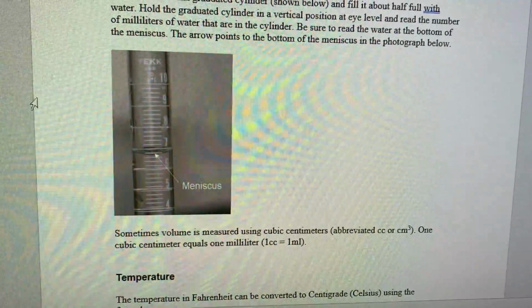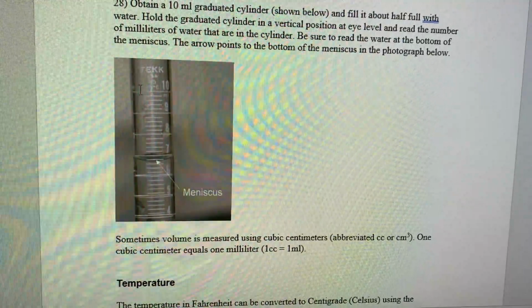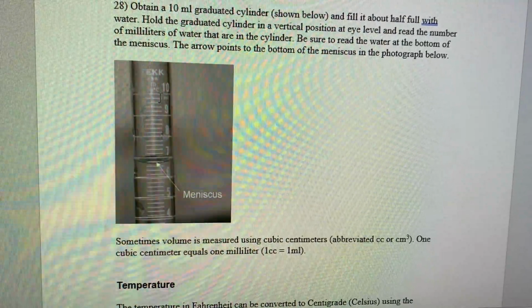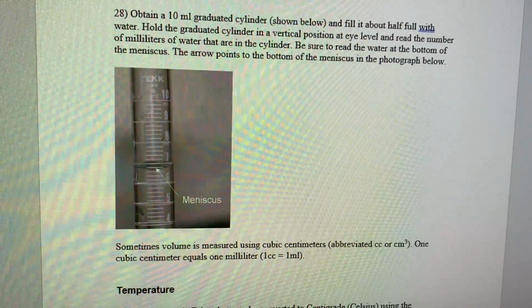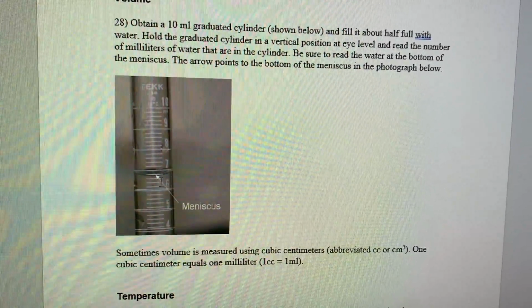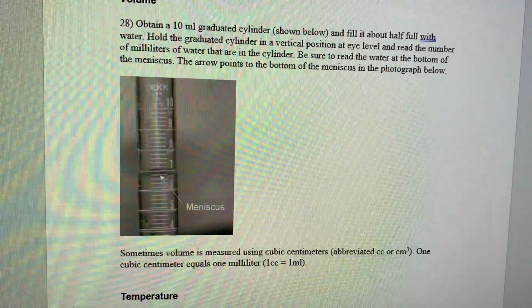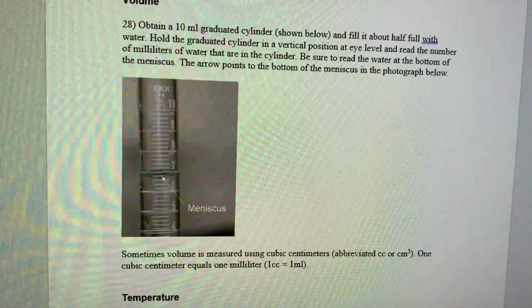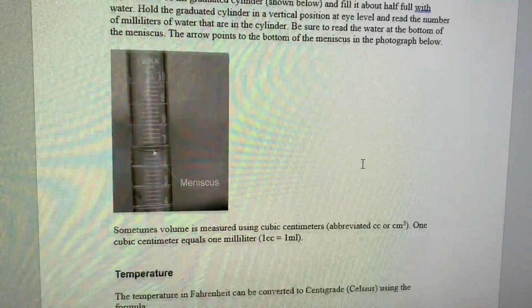And this is the measuring glassware. It has numbers that measure the volume, and it's very important to measure an accurate and precise volume by observing the meniscus. This is physics. Due to the air inside the glassware, I need to consider the meniscus. I will draw it for you right now and explain it.